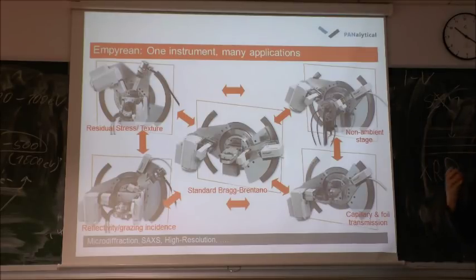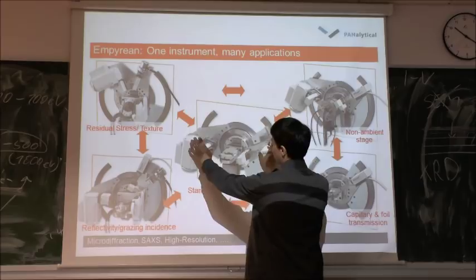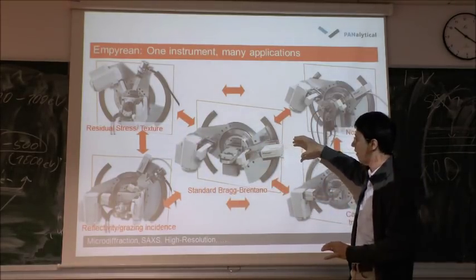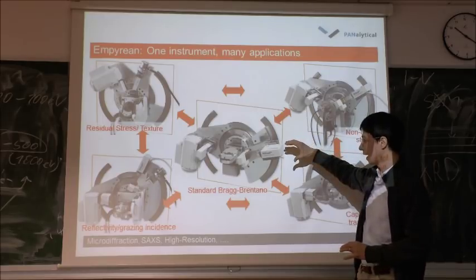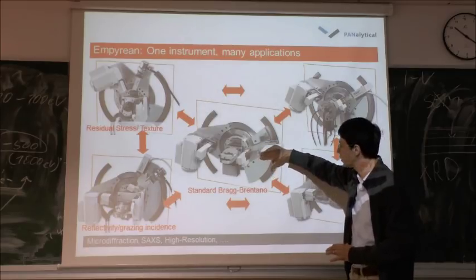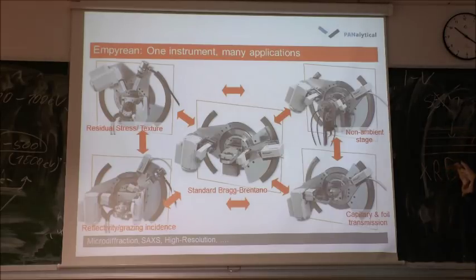Horizontals are used for larger wafers, let's say above 6 inch, because in these cases both optics have to be further away, and then this is getting heavier and heavier, and as the mass is bigger, it gets very hard to very precisely control the exact angle of the arm. So when you put those two arms on the back, there is much less force because you rotate them in plane. Yeah?